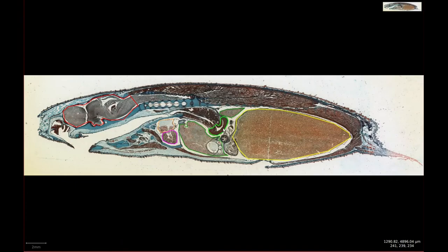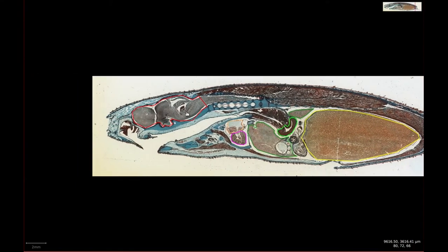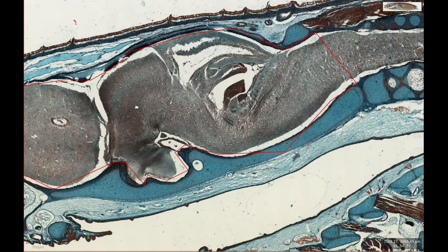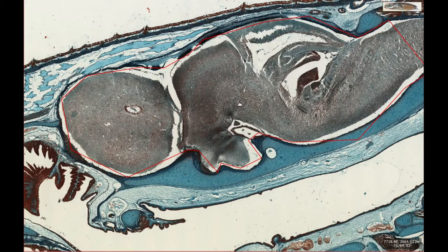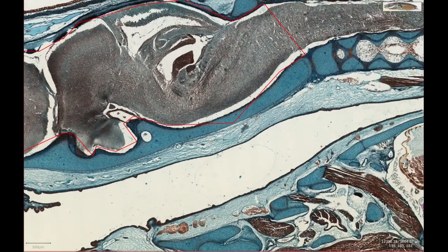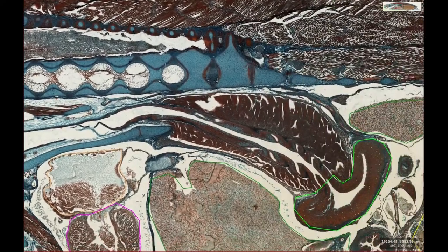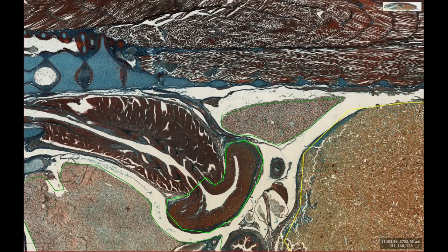The next section closest to the midline is slide 243. Looking at the head, we still have a good portion of the brain, but we don't have any eye. However, looking caudally along the back, we don't have very much spinal cord or notochord, indicating that we're just off the midline.